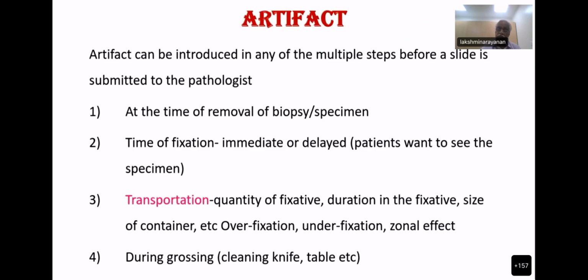If it is a biopsy or something, it can affect, but if it is a very large tissue, it may not. But in the case of breast and other cases, about which so many lectures have been given, the tissue should be immediately fixed. Then transportation. Again, in a hospital, you can get it from the theatre. But when it is given to some other centers, when it is a long distance, suppose from Assam, somebody wants to send a biopsy to Mumbai or to Kerala, then how much quantity of fixative have they kept with the tissue? How many days was it in the fixative? Because the courier itself sometimes takes 4 to 5 days. And then the size of the container, sometimes a large tissue is kept in a small container.